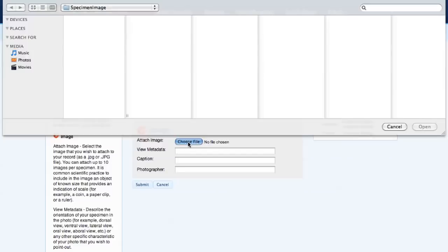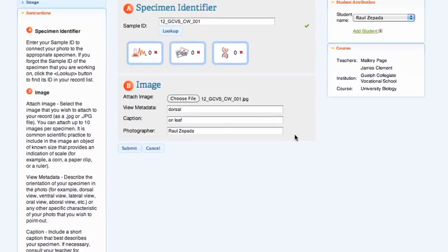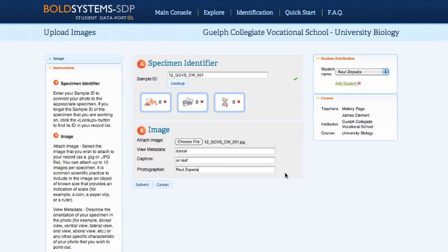Students must choose a JPEG image to upload to their record. They can add view metadata like dorsal or ventral, a caption like 'on leaf' or 'under rock', as well as the name of the photographer. Multiple images can be added to a record, but they must be uploaded separately. If images need to be deleted from a record, please email edu@boldsystems.org.